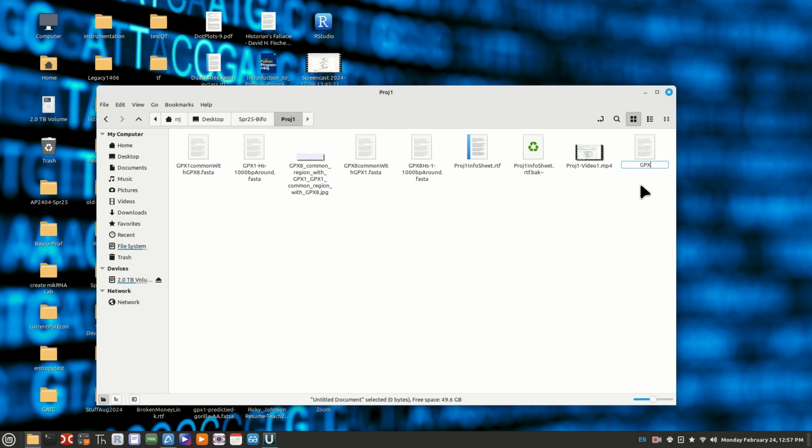GPX8 and GPX1, common parts. Okay, it isn't real explanative. You'll see after I do it what I'm doing. Alright, FASTA.